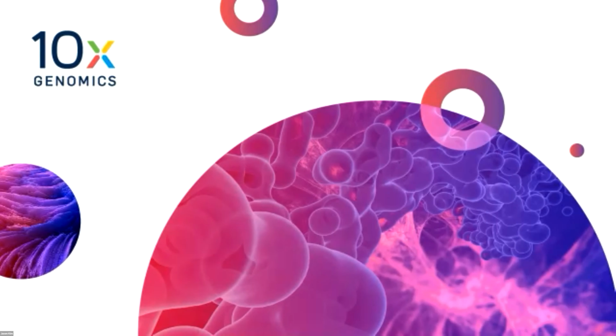I can send a list of which cores and facilities have capabilities right now to do Visium that's relatively in the area. I can also break it down into full service versus semi-full service. So there are full service where I give you tissue and my Visium slides, and you do the cutting, mounting, processing, and give me data. There's also some where you slice it and put it onto the slides and send me the slides, and then I can process them. So I will send both options to the group.